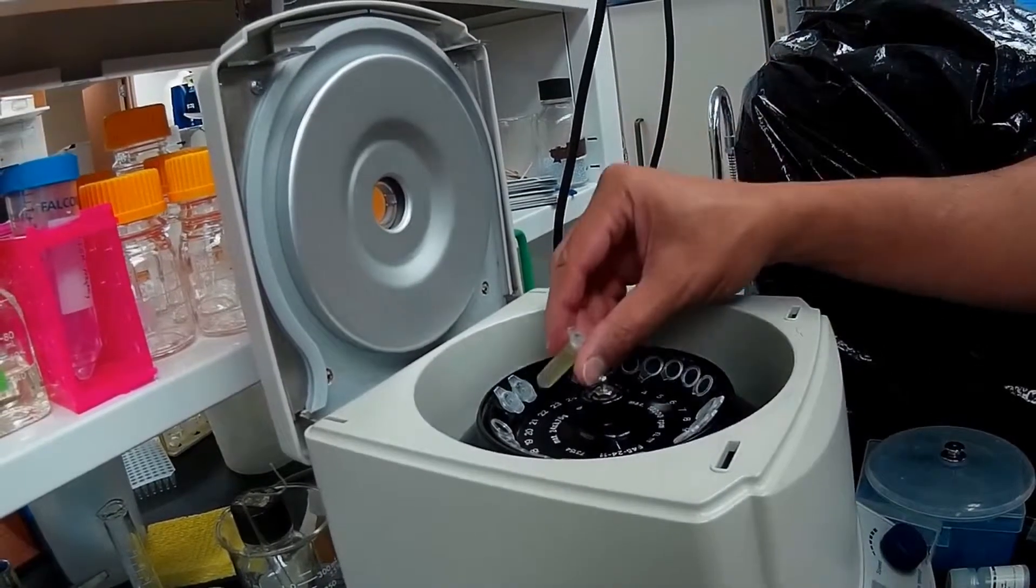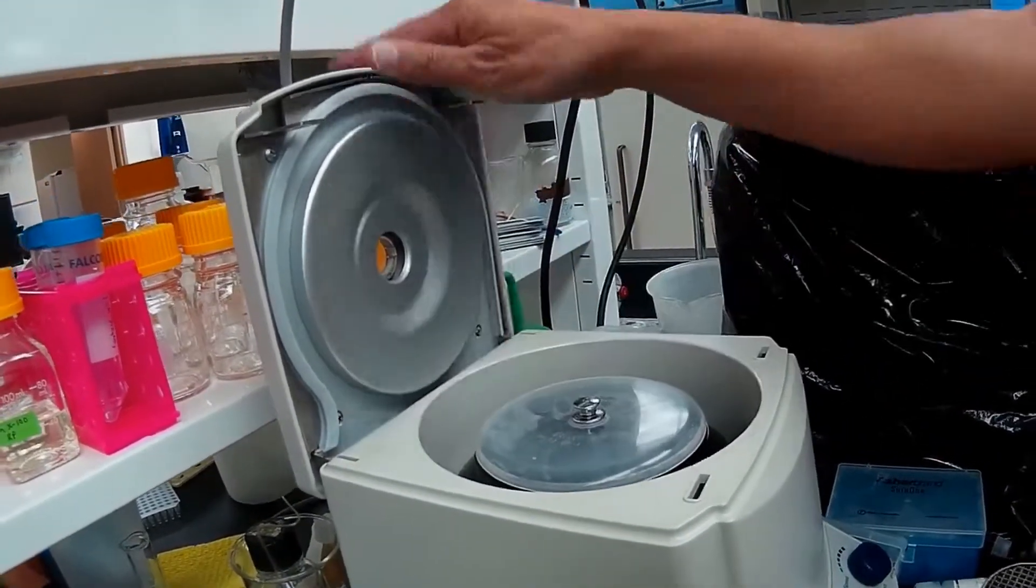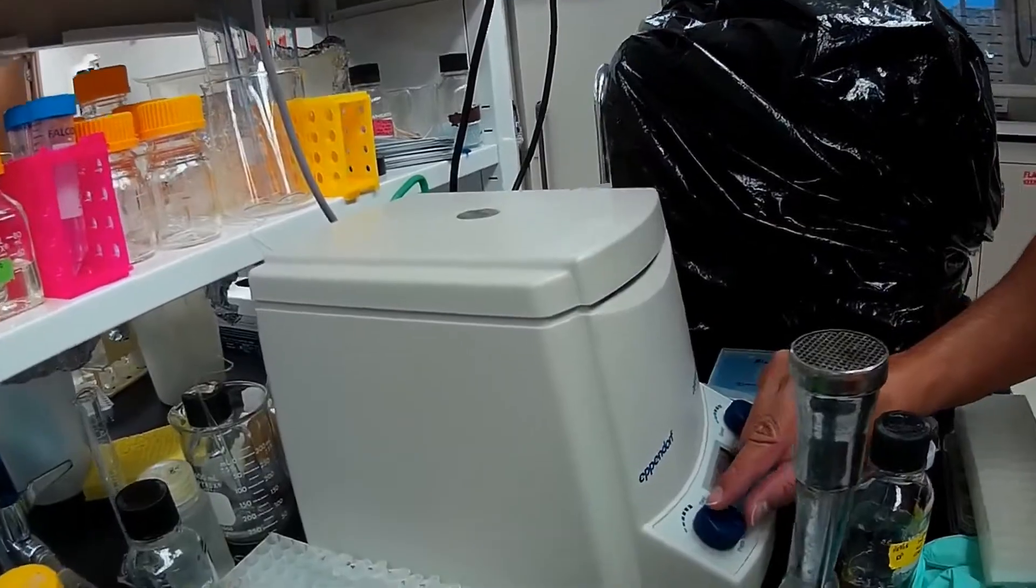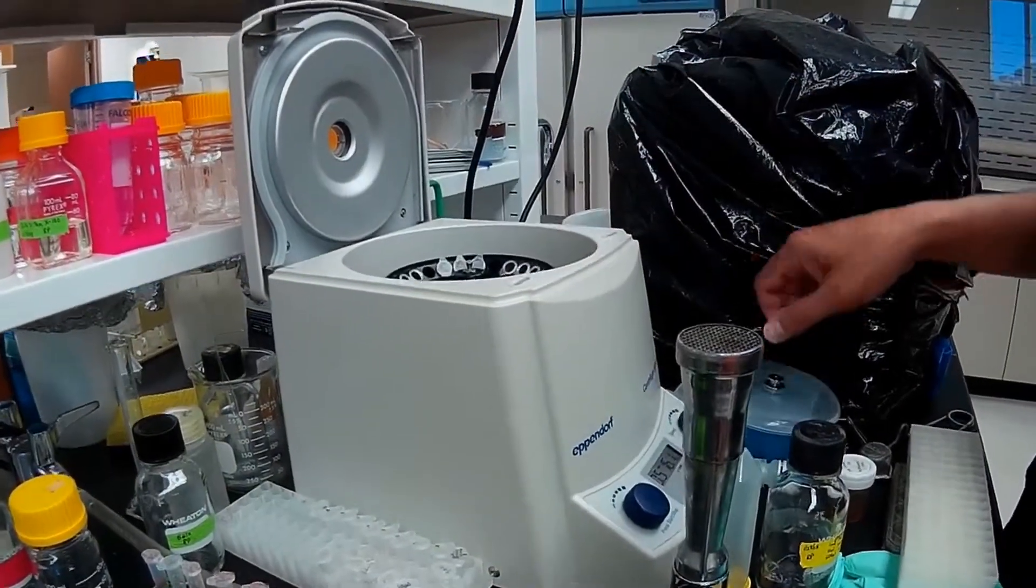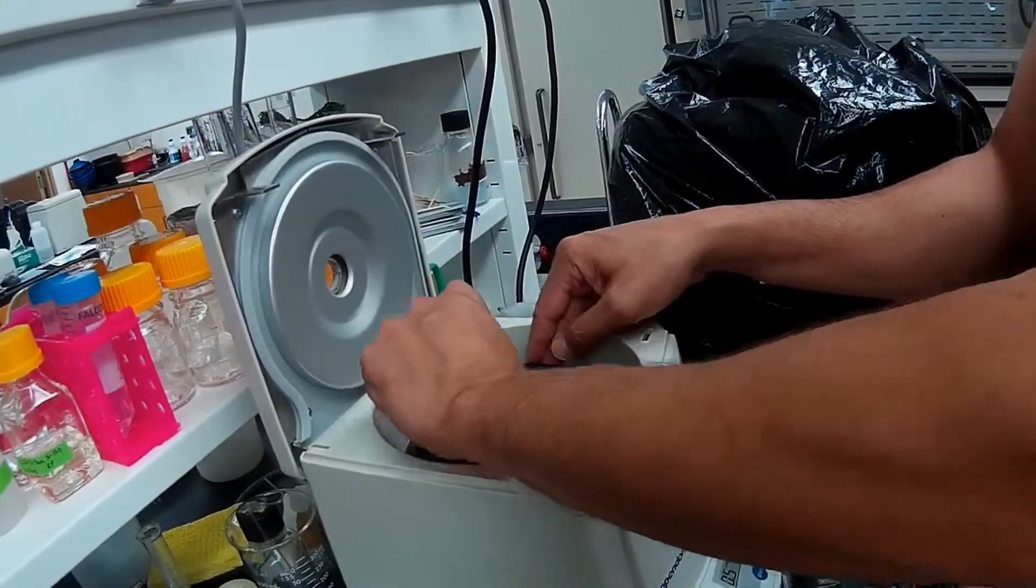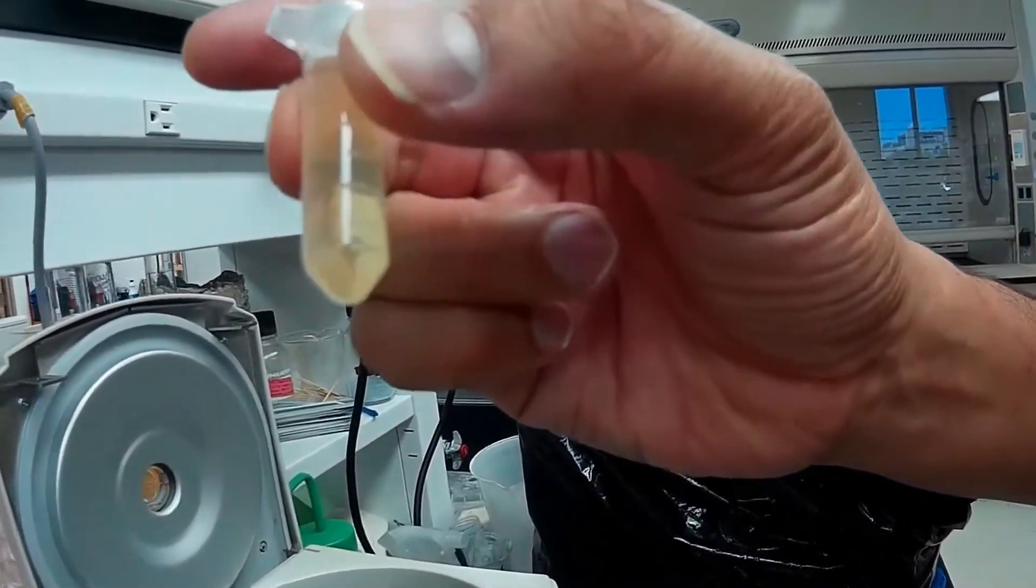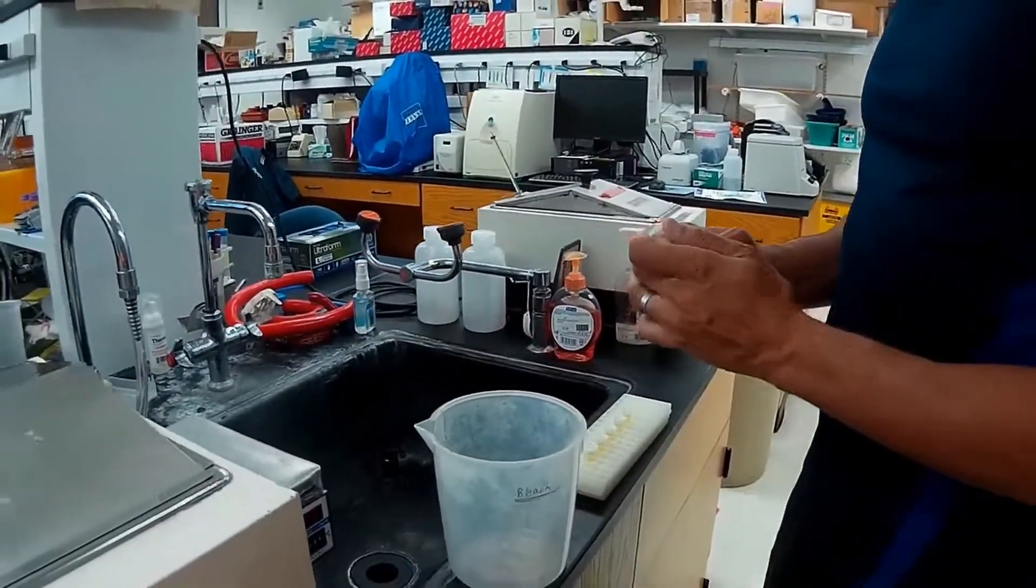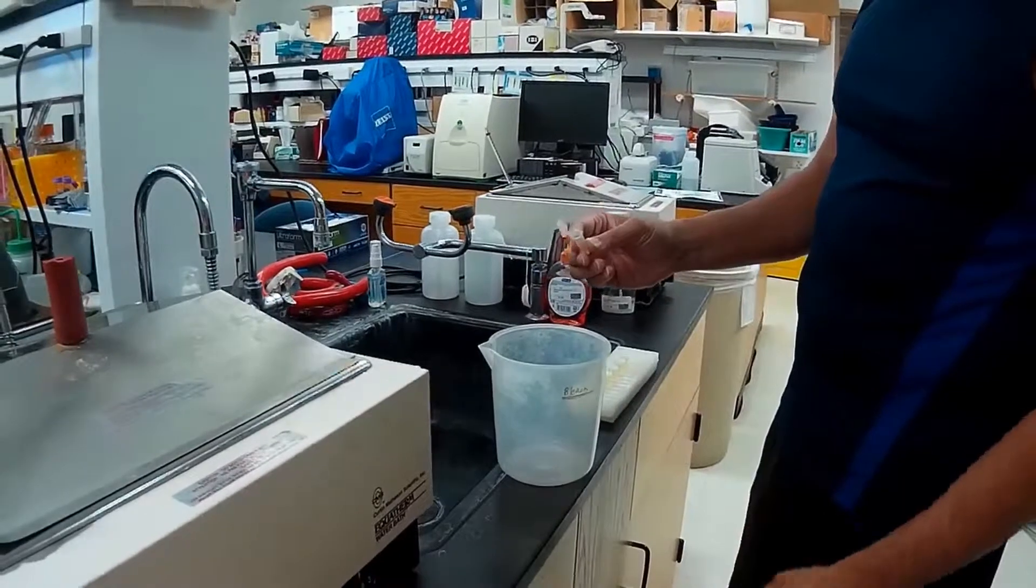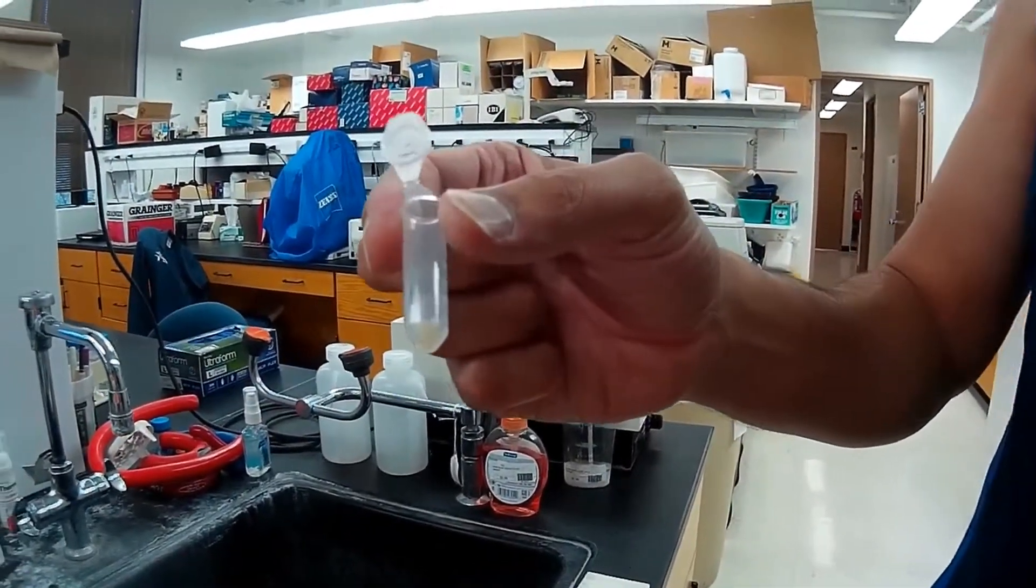The cultures are spun in the centrifuge for 30 seconds, max speed. You can see the LB is clear and the pellet is at the bottom. The supernatant is discarded and will be bleached later. You can see we have an E. coli pellet there.